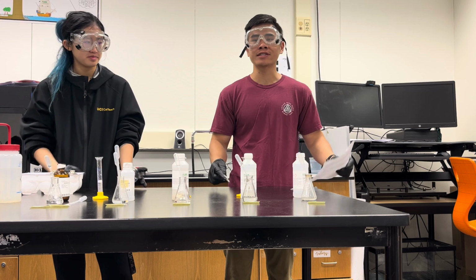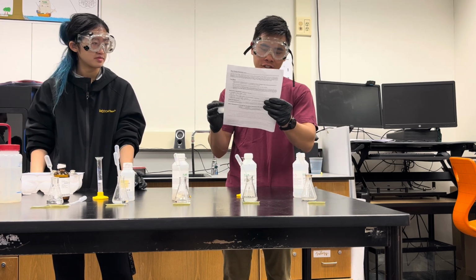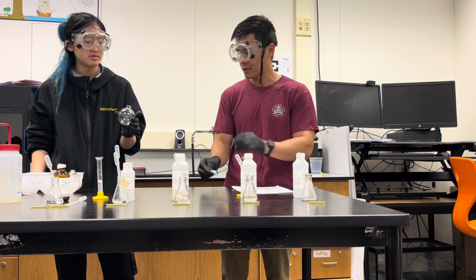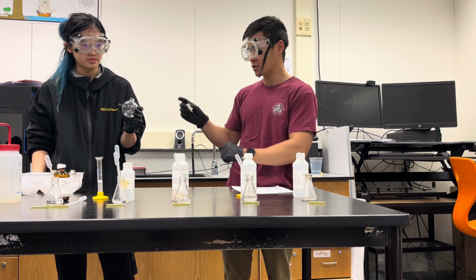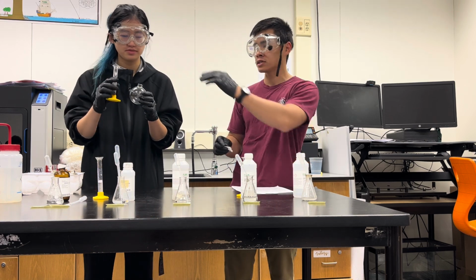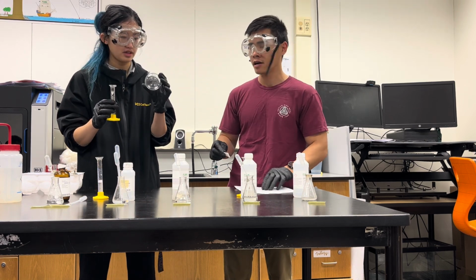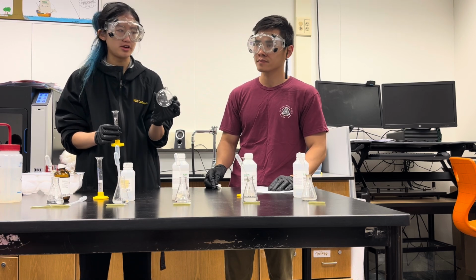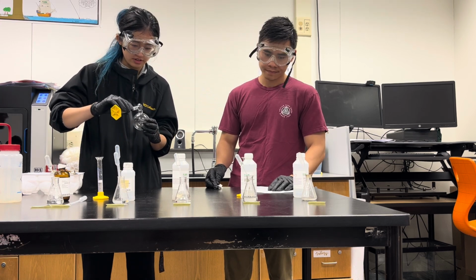So afterwards, the instructions say to do 3 things, and this all has to happen at once. The first one, you're gonna mix dextrose. That goes into the dry glass ornament. You shouldn't see any more liquid inside here when you're gonna pour it in. So this goes in first.